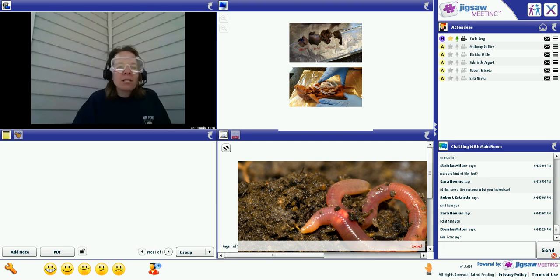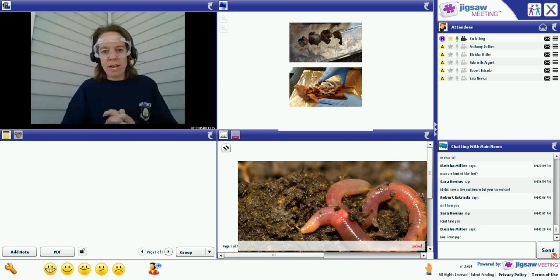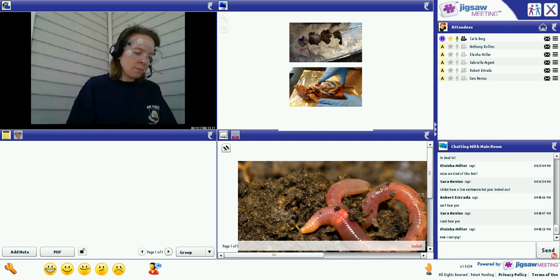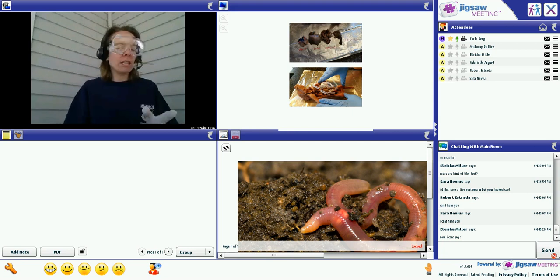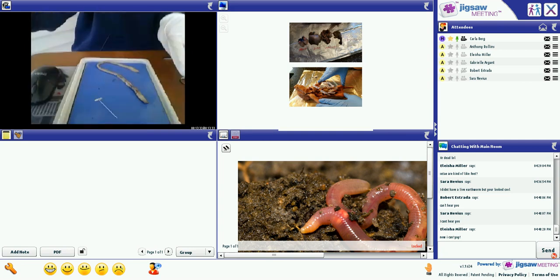Okay, now I don't want you to worry about building diagrams or anything right now. We're just going to cut and dissect right now. But now we need to open this worm up. So in your lab kit, there are several pins. We're going to use those pins to open up our worm. Watch me first, then you are going to do it. The tray you're using is one of those self-healing blue mats, so you're going to poke the pins right into the mat. Not a big deal at all.